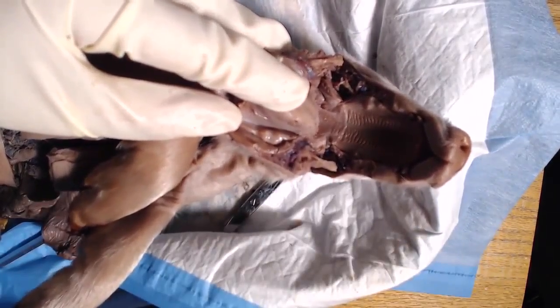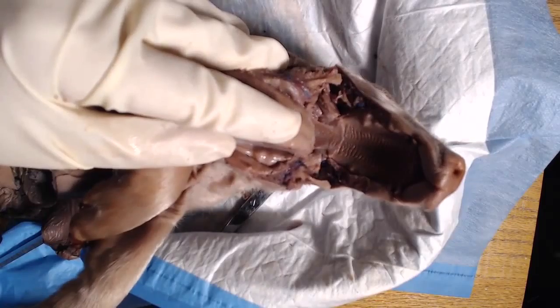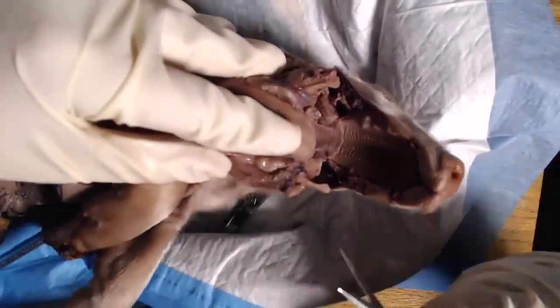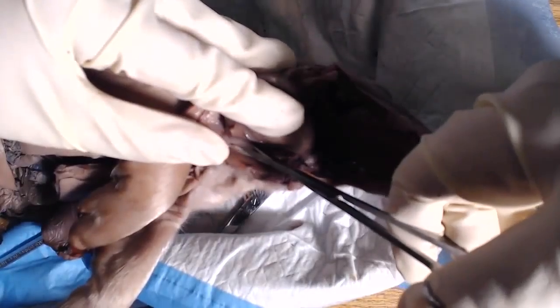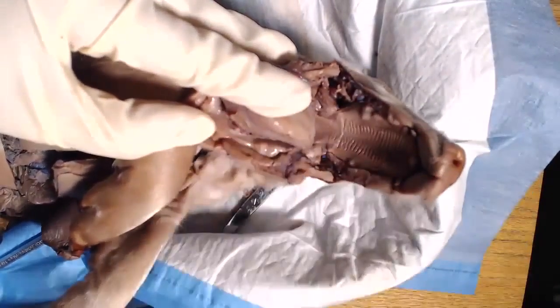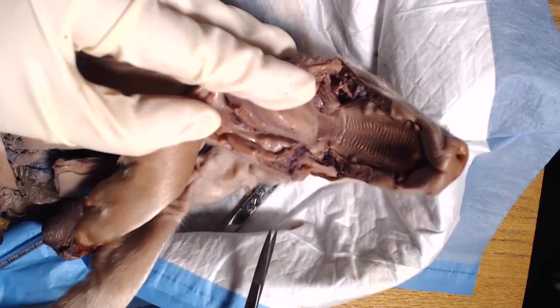Now at this point, you can take scissors and just cut into that tissue there. Not too deep. Just make short little cuts into that tissue. And we're going to look for another gland just below the surface of that tissue. So just be real careful. As you can see, I just made tiny little cuts at a time, just under the tongue.